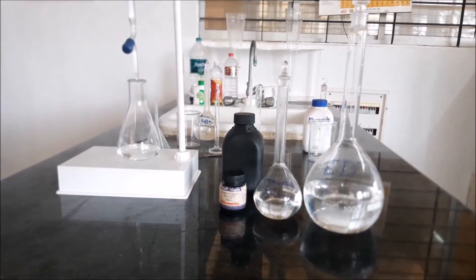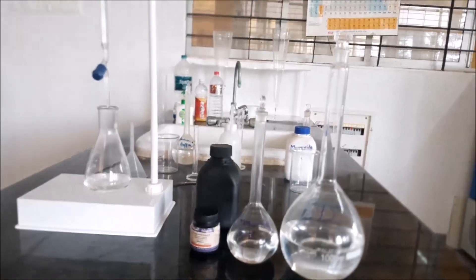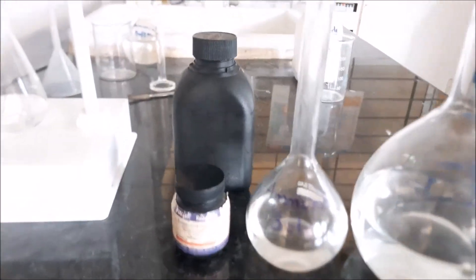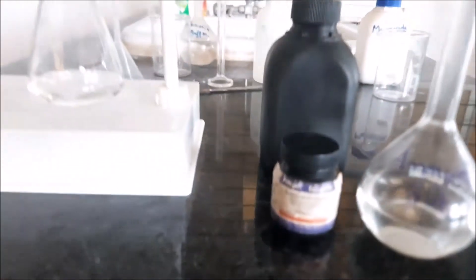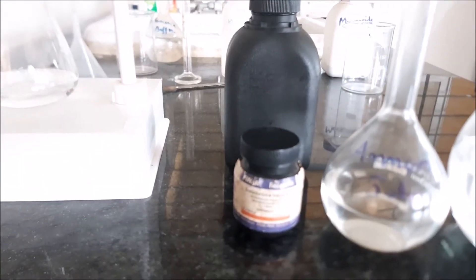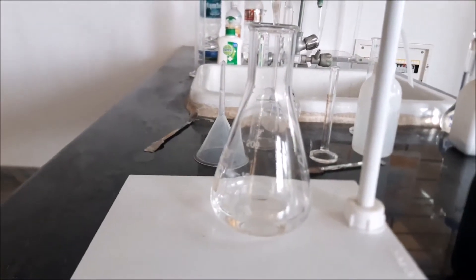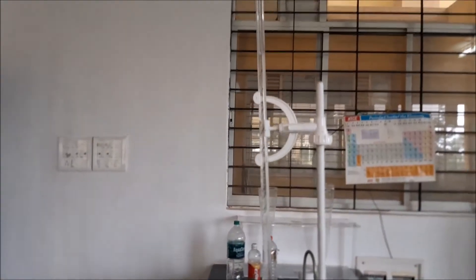Today we will be testing determination of hardness. As you can see, we have taken EDTA, ammonium buffer solution, the indicator Eriochrome Black T, and a sample of 50 ml of tap water. In the burette we have filled it with EDTA solution.